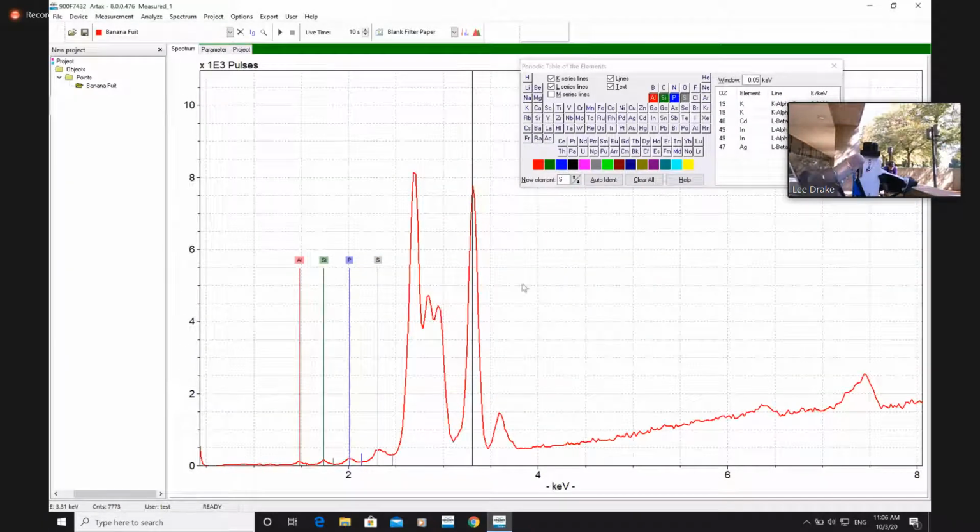And then here, we have 2 big peaks. The first big peak here, when I click on here, I get the following possible elements. Rhodium, which is one of the rarest metals on the planet, ruthenium, which is rare, and technetium, which is not only radioactive, but decays in a state of nature very quickly. You can use it for x-rays in a hospital, but it has to be synthesized. What's going on here? Well, we're not measuring the banana, we're measuring the reflection of the XRF off the banana. In this case, we're measuring the rhodium that we use as our target.